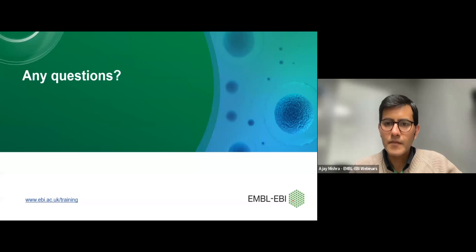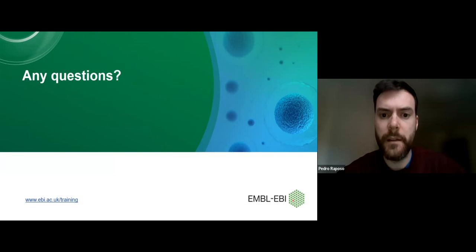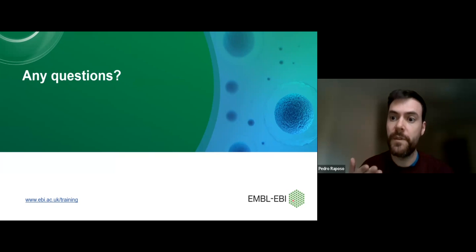Yeah. Also, I didn't entirely understand the question, but there are also other ways for you to infer the protein function. We have automatic annotation systems that try to predict what the protein does and its characteristics, and we have that available to you. If you want to have a look, we have a software called UniFIRE, where you can input the sequence, and the software will try to predict what the protein does.